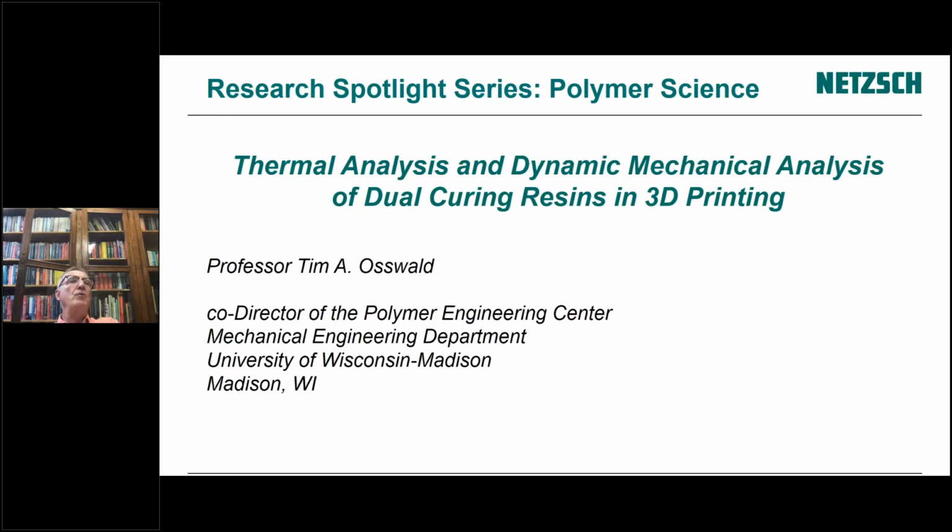You know, we did not do a comparison with the Friedman. The nice thing of the Friedman model, and I think all of them, I think it's a matter of preference, right? Friedman is nice because you can very easily get the activation energy. Well, you still can get it with the other ones. Even regular fits.